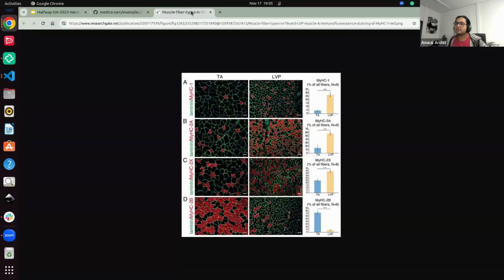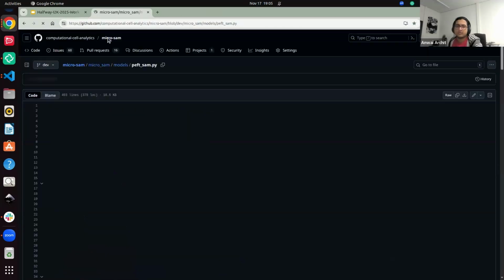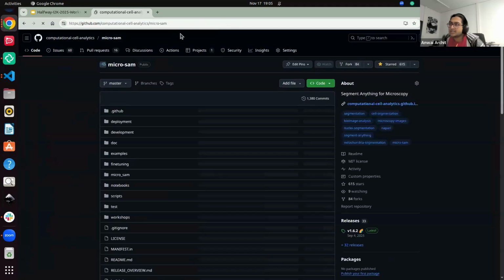No. Yeah. Let me open Microsam so that I can walk you through a few things if there are any questions. Okay. Any more questions?